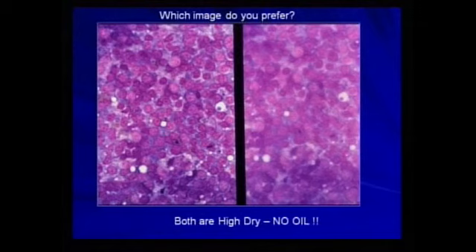This is the difference that is seen when you cover slip a slide and when you don't. Okay, it's the same slide. The picture on the right was taken without a cover slip. The picture on the left was taken with a cover slip. Remember that the objectives of your microscope are calibrated for cover slip slides. And so it has trouble focusing without that little tiny piece of glass or plastic between the cells and the objective itself. So always cover slip your slides after they are dried. A little bit of glue, a little bit of cover slip. You will be very happy with your results.